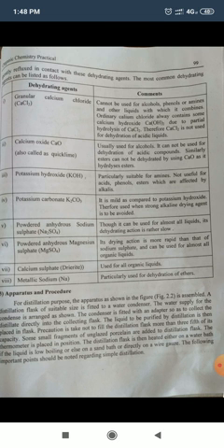Next is the dehydrating agent powdered anhydrous magnesium sulfate, that is MgSO4. Its drying action is more rapid than that of sodium sulfate and it can be used for almost all organic liquids. The dehydrating agent calcium sulfate is Drierite, used for organic liquids. And the last dehydrating agent is metallic sodium, that is Na, particularly used for dehydration of ether.